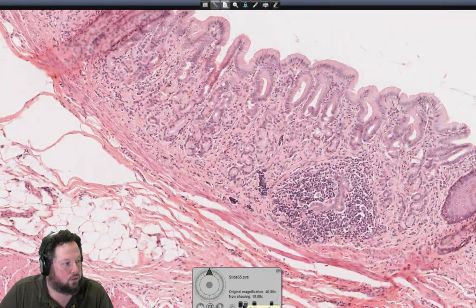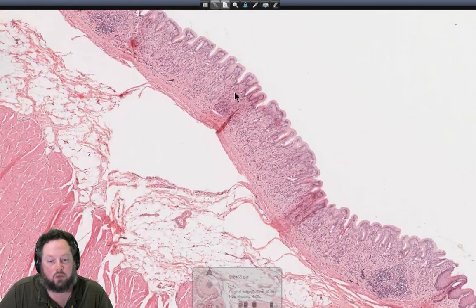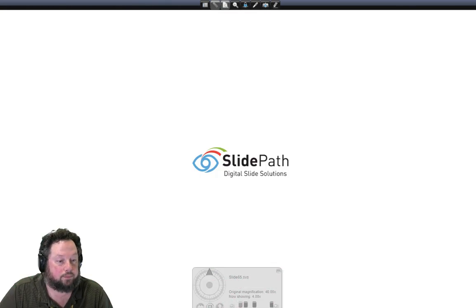All right, so it's very quiet in the chat room, so I assume that there's no questions. So we'll move on to the next slide, which is actually looking again at the body region of the stomach.